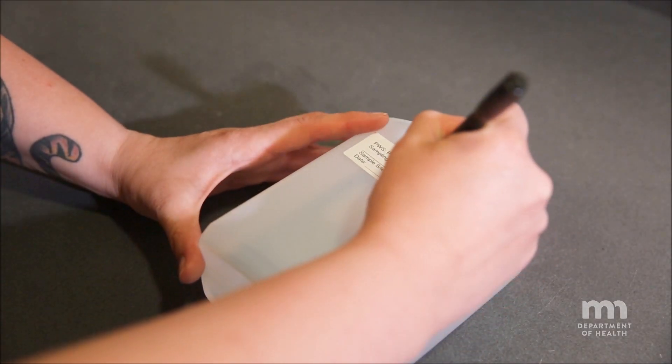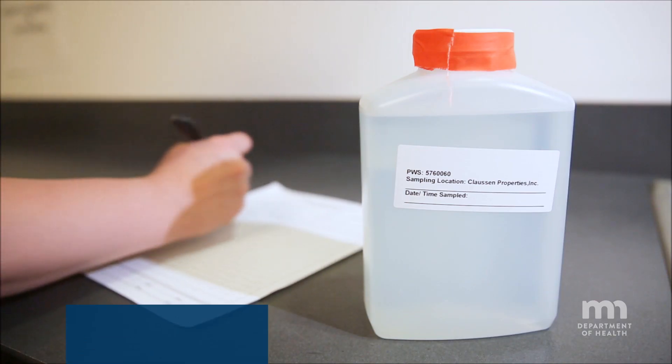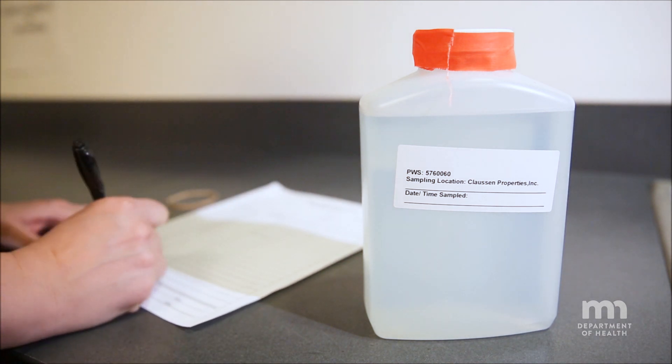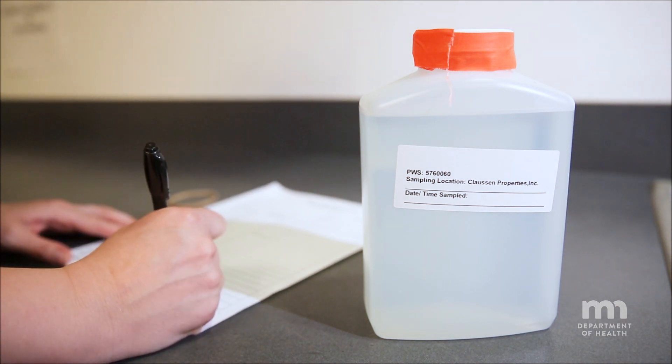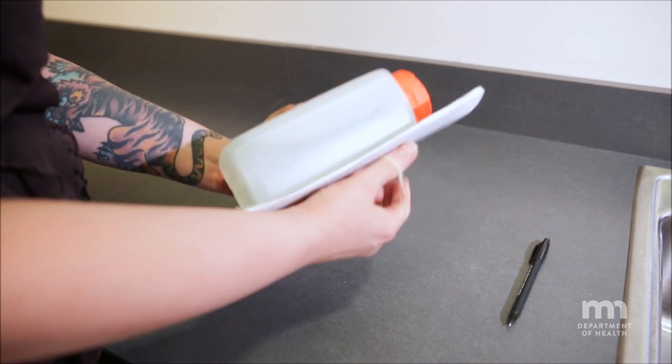Complete the label on the bottle. Complete the tap water sample form. Your utility cannot accept samples without a completed tap water form. Let your utility know if you need help to answer those questions. Attach the form to the bottle using tape or a rubber band.